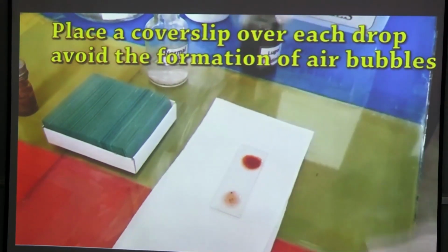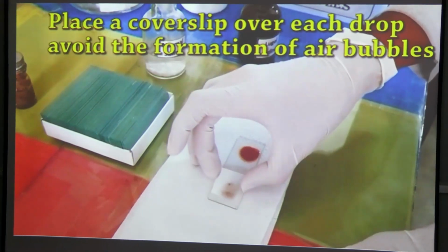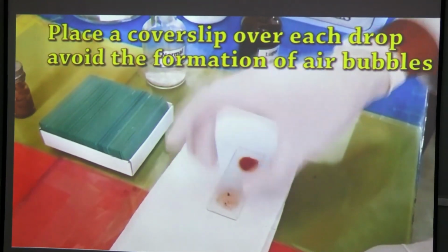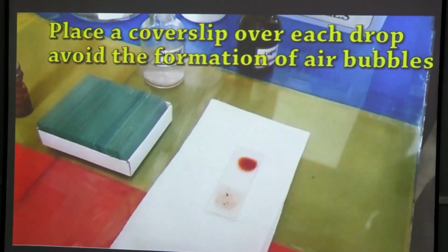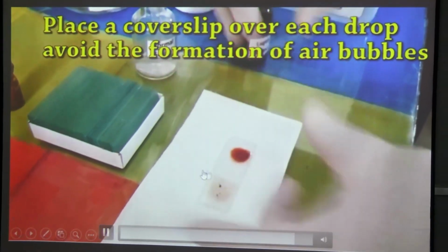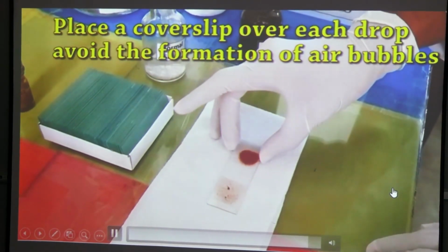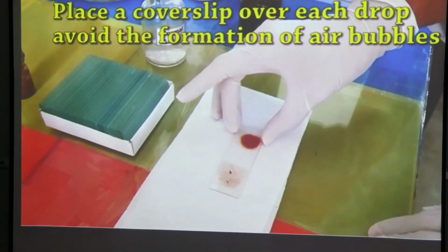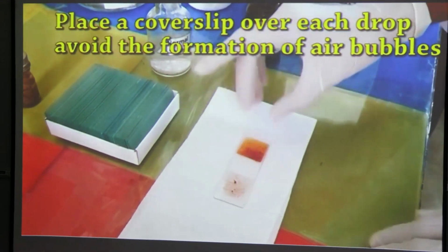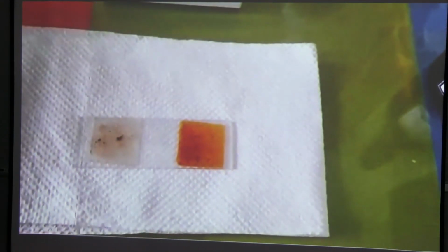Now we will be putting the cover slip. Why do we put the cover slip? So that the stool doesn't contaminate the microscope. Okay, so our slide is ready.